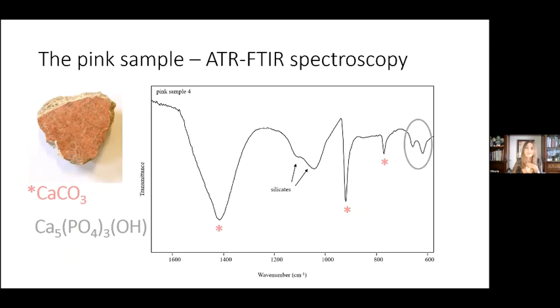It must be stated that the presence of silicate, recognizable by the bands around 1000 cm⁻¹, and probably due to the cluster, has made the detection of phosphates more challenging, since several important features of calcium phosphates themselves are hidden.